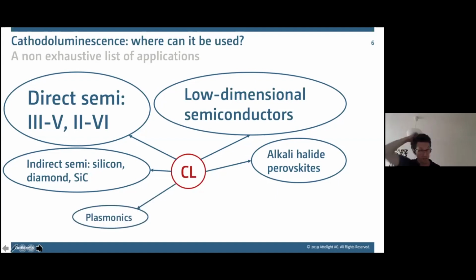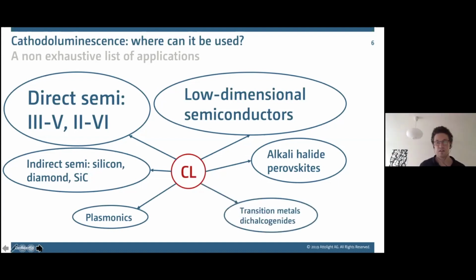Then it's been quite a bit used in plasmonics, just because you have a nanometer scale probe and you can really excite plasmons quite easily. Then transition metal dichalcogenides.